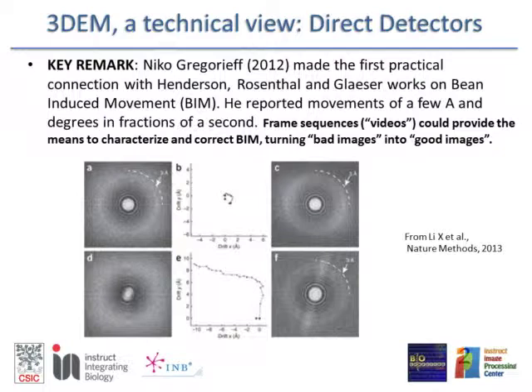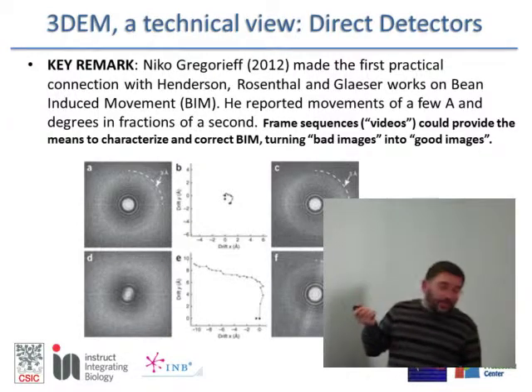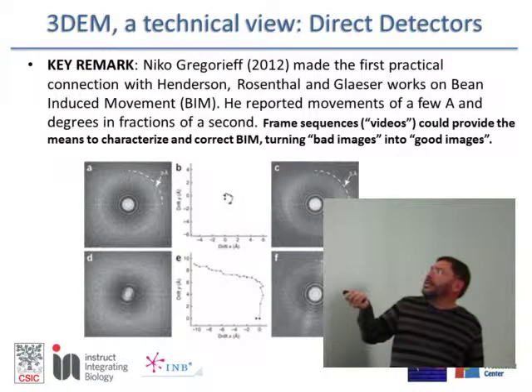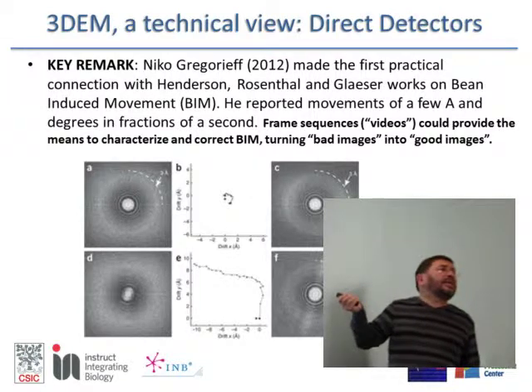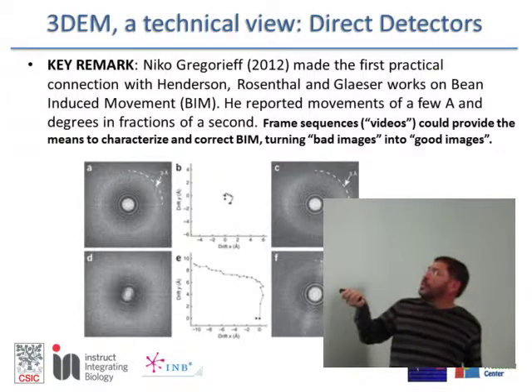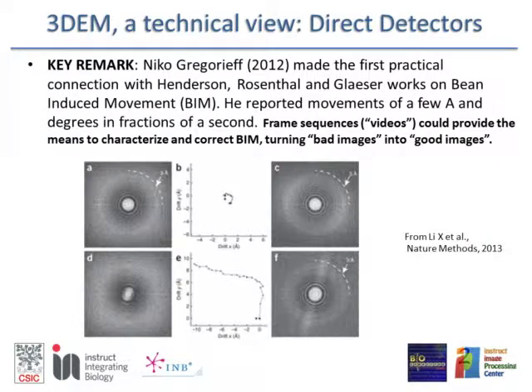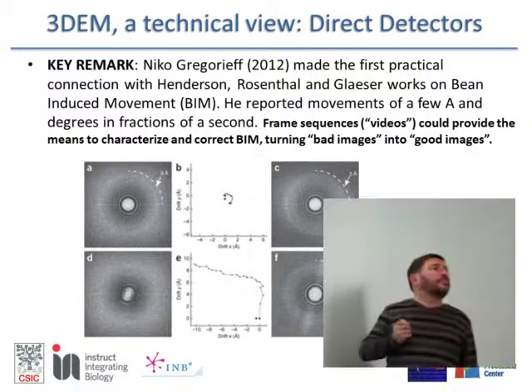Because here you see, look at that. This image from your place, probably you cannot say much. Maybe you are not so well trained, but anyway, this is a fantastic micrograph taken at a very good microscope in the world that happened every 100 times. So once every 100 times, in the best settings that you can imagine, you get one image like that. 99 times you get an image like that.